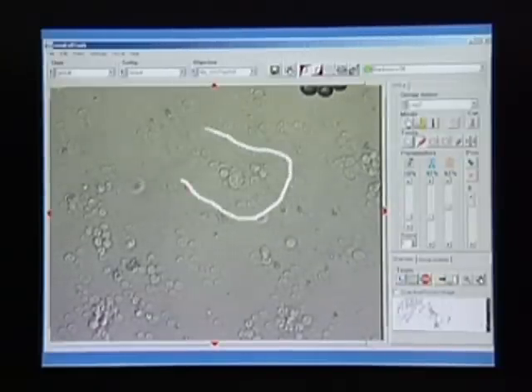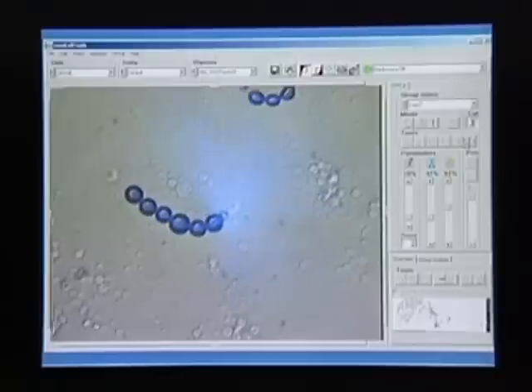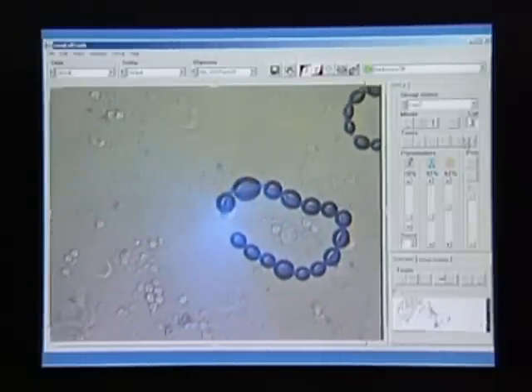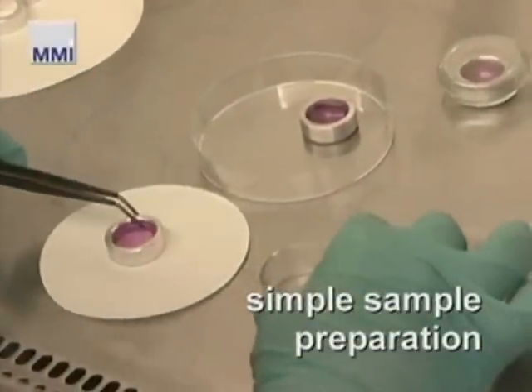In this process, the cells and the membrane are cut until the metal ring is removed. The samples remain in the culture dish, the morphology of the specimens remains fully intact and can be documented. The dissected cells are now ready for further processing.